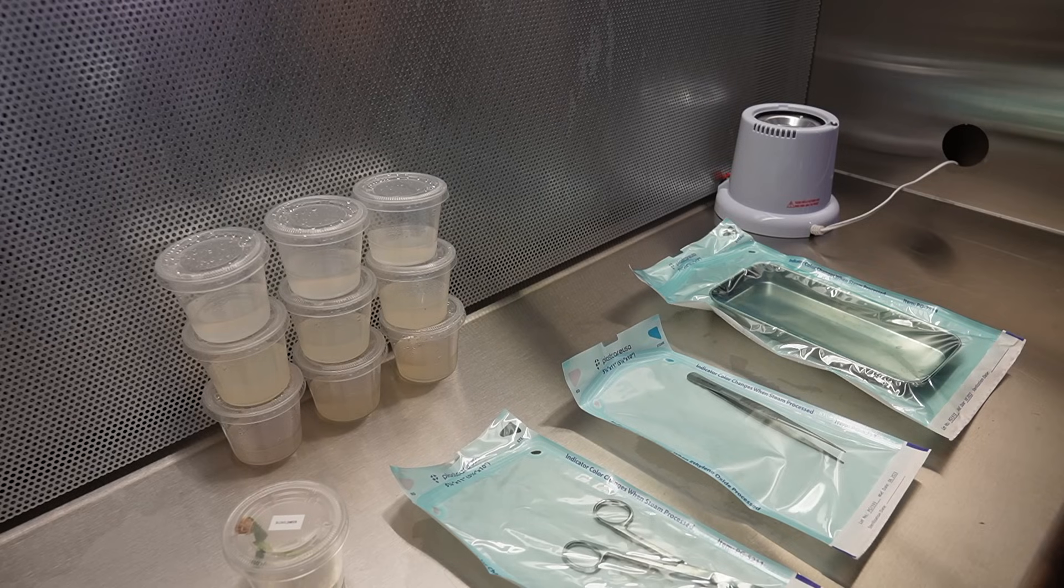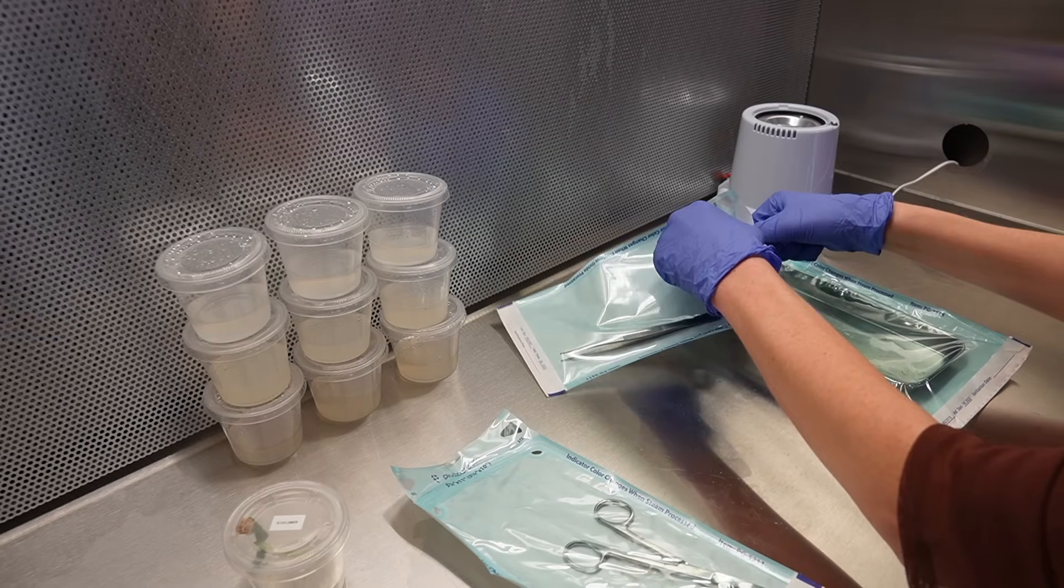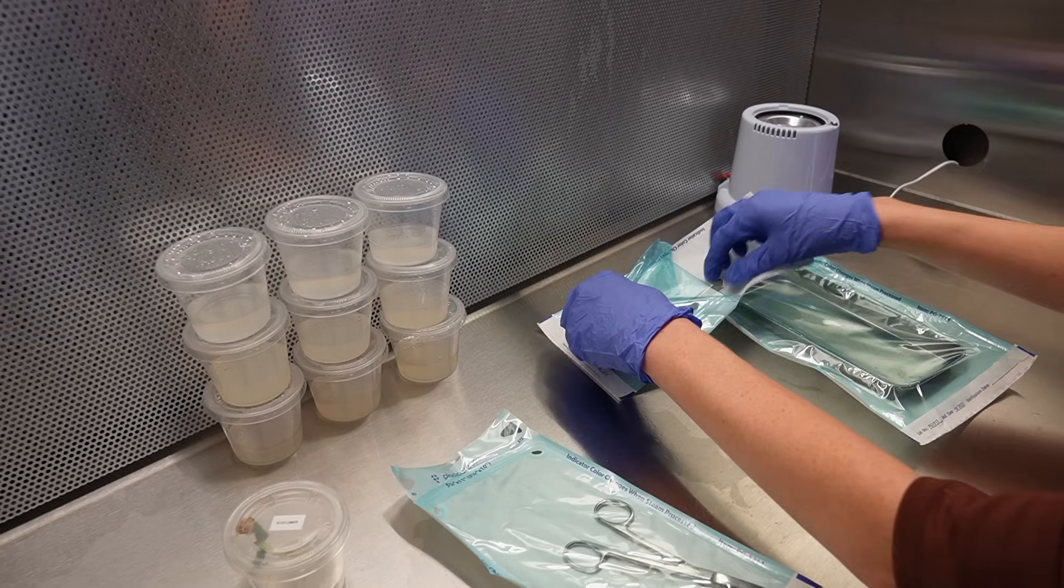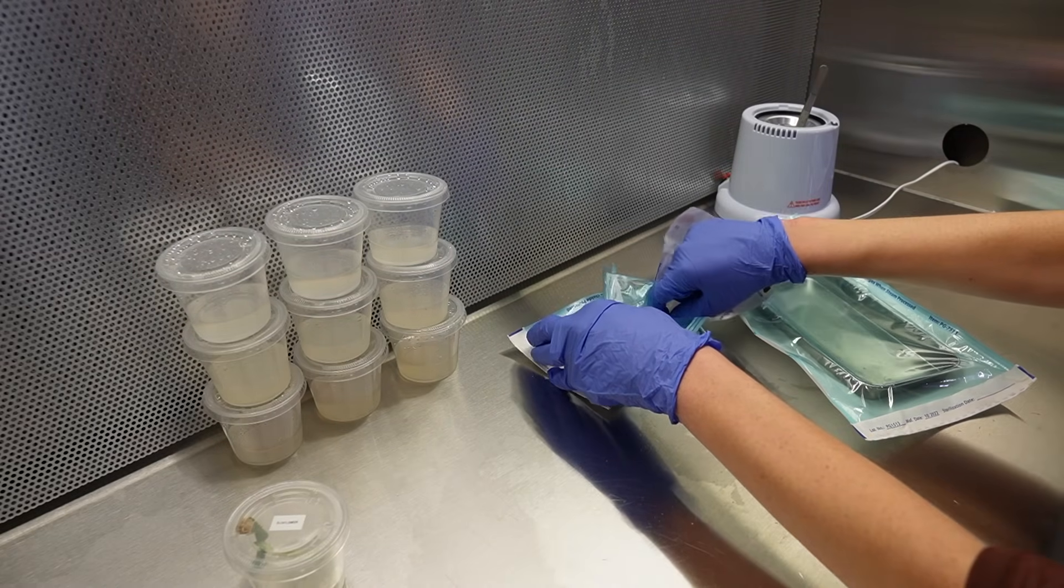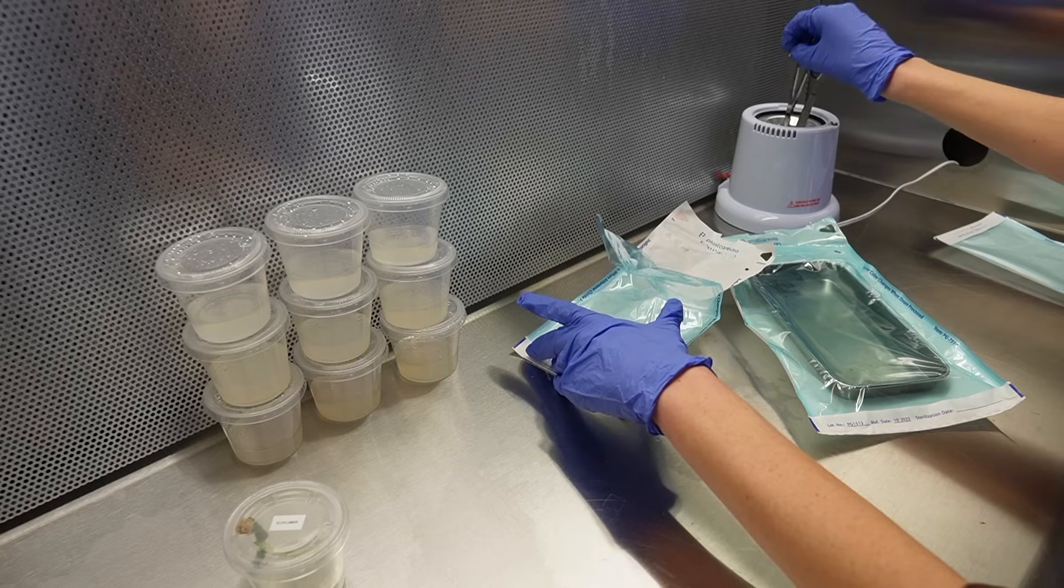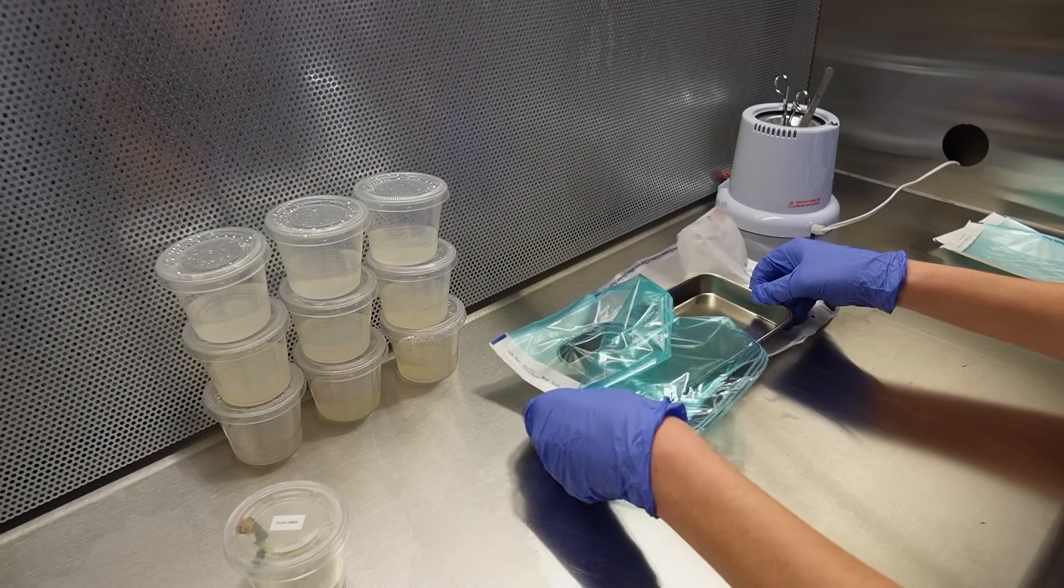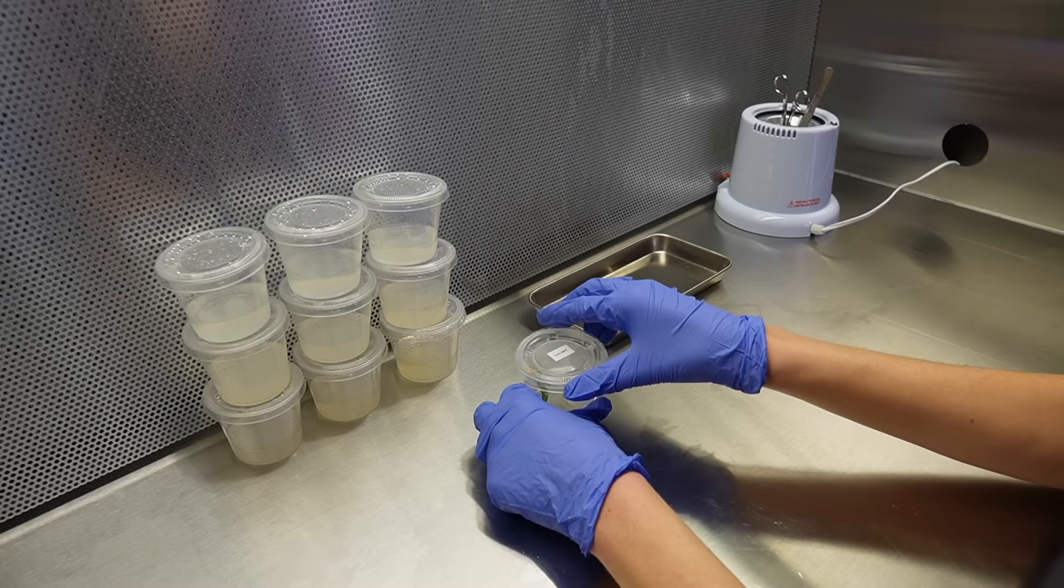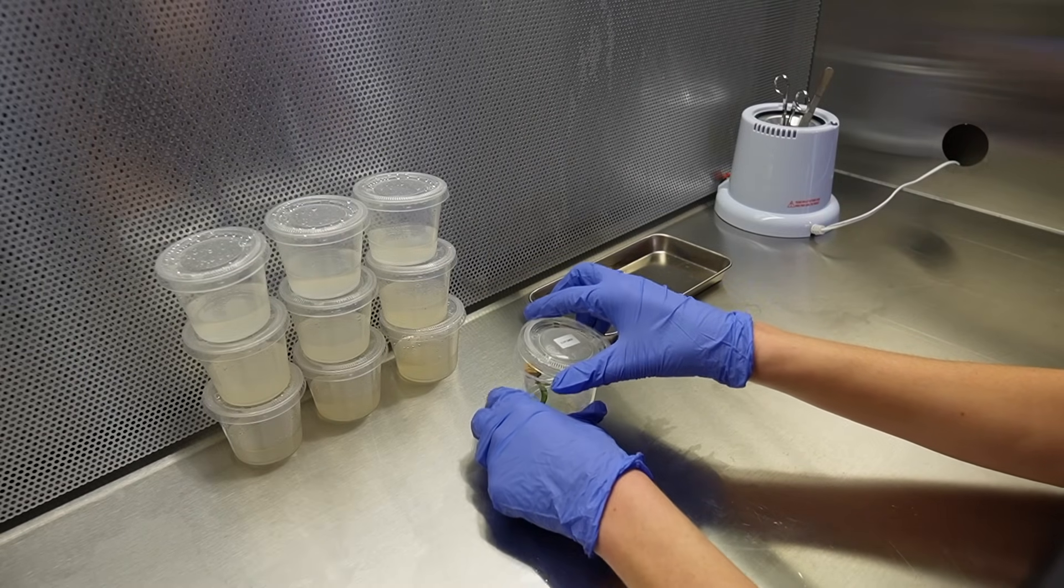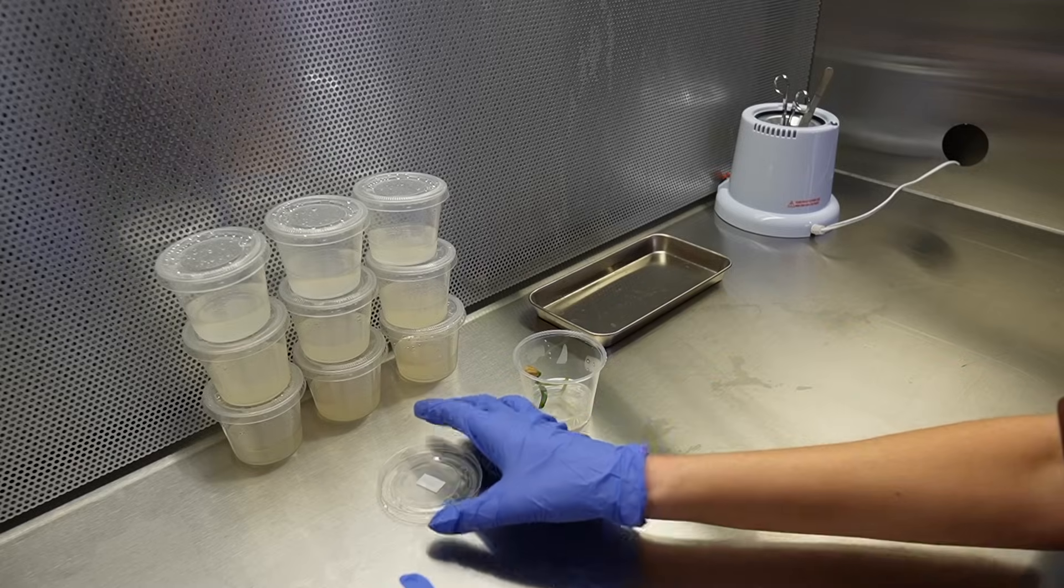For the flow hood, I have my glass bead sterilizer, forceps, my multiplication media, and my seedlings that we grew earlier in this video. I also have a stainless steel tray and a pair of stainless steel scissors, both of which have been sterilized in an autoclave. You could also use a pressure cooker to sterilize these items at home, the same way we sterilized the forceps earlier.